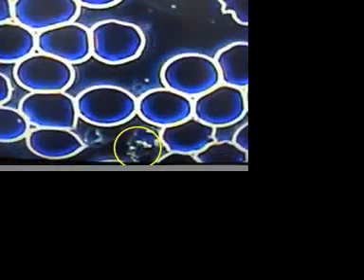Right in the middle, you can see what could be some inclusions or some cysts, but it's hard to say. Down here, away at the bottom, this also looks like some inclusions or cysts, but again, the cell wall of the blood cell does not look intact, and that may be why they're in motion. You can see other things up near the top. You can see what is probably just a piece of broken cell wall and not an Organism X.